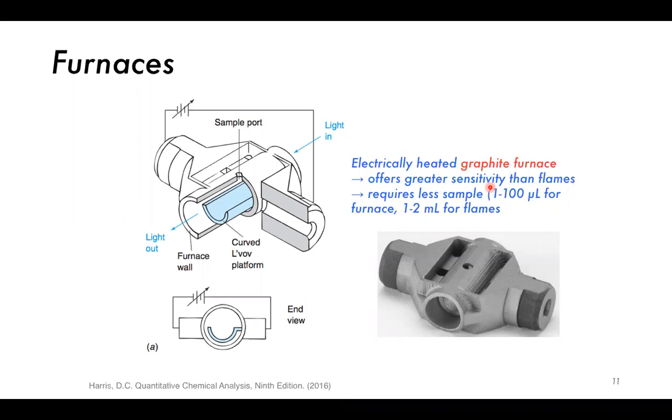That's what I said back at the start, that atomic spectroscopy of this sort typically utilizes large samples, especially the ones that use flames. So it's really just for bulk materials. It's not really suited for fine chemistry and pharmaceutical type applications. You need a furnace for that.